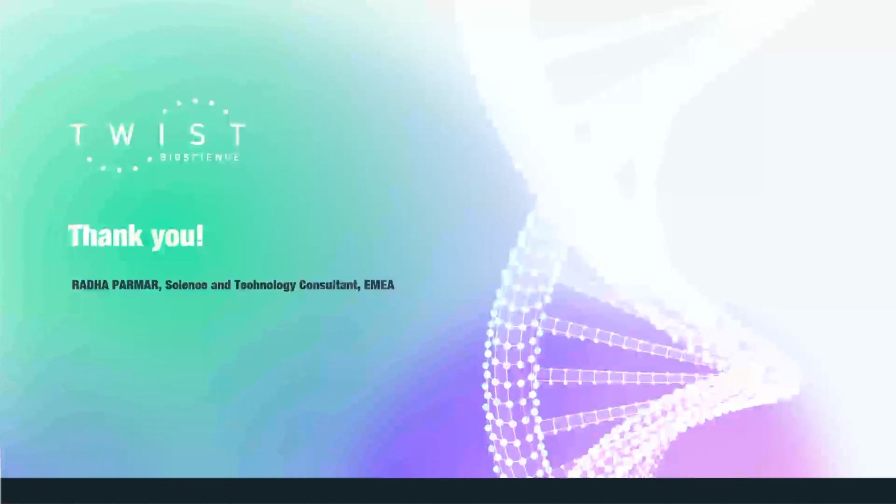Thanks for the nice talk again. I might have missed it, but this is a synthetic way of generating a library. Has this been compared with the natural way, in the form of polyclonal antibodies? You gave one example of monoclonal, I guess.